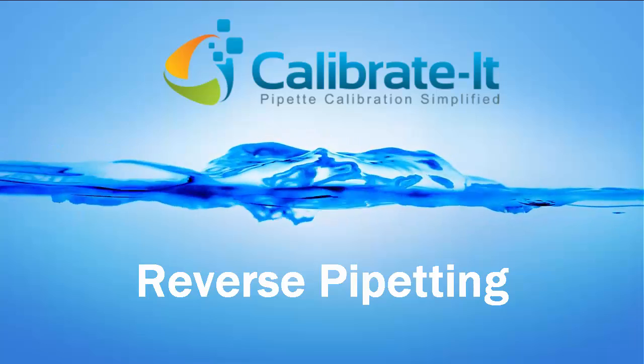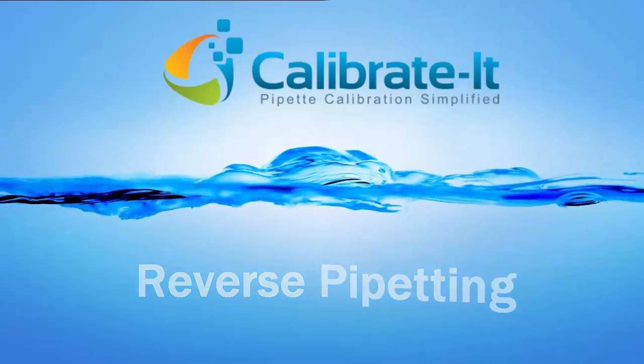Welcome to Calibrate It and Reverse Pipetting. What is reverse pipetting and when should you use it?